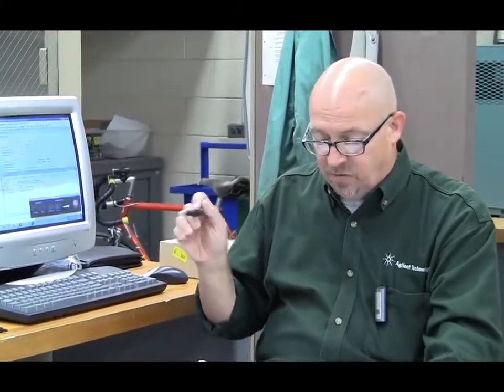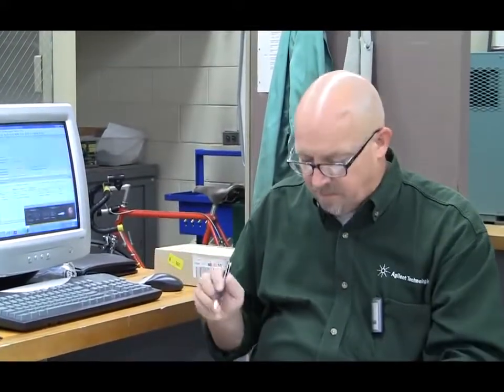So the main thing that affects a mole sieve adversely is going to be water. It doesn't like water. Syngas generally has water. It also doesn't like CO2. And the two have 2 different effects on a mole sieve. One is, on a mole sieve, the elution will start, all of the peaks will start shifting forward. That means it's wet. If you start losing sensitivity on everything, that's CO2, and that's harder to get rid of. The main thing we want to do is make sure we get CO2 off of that, keep it off of that, which shouldn't be hard to do at 10%.